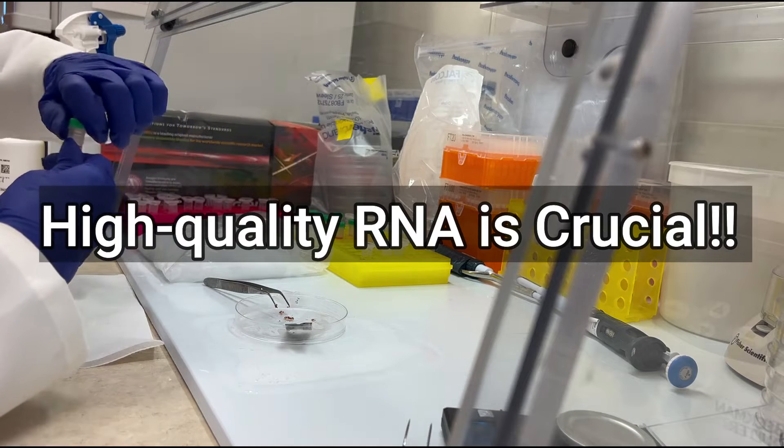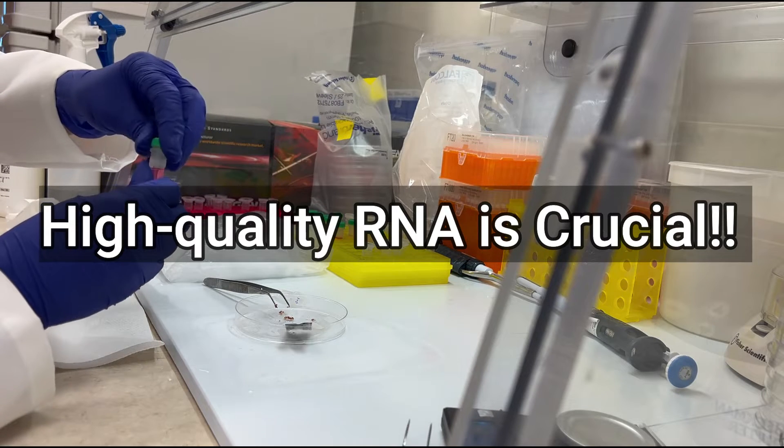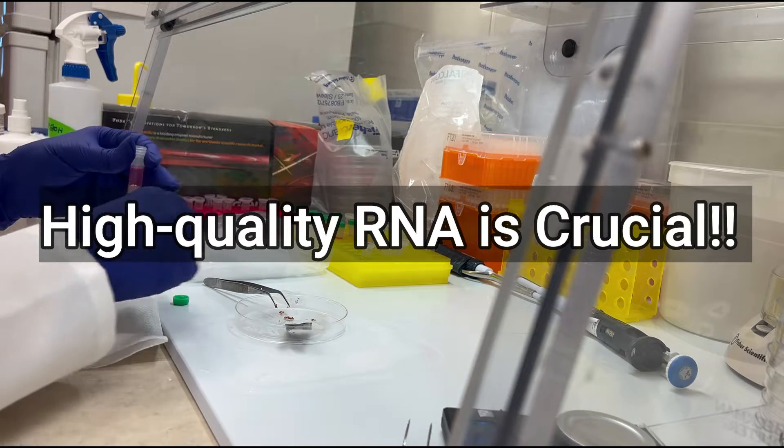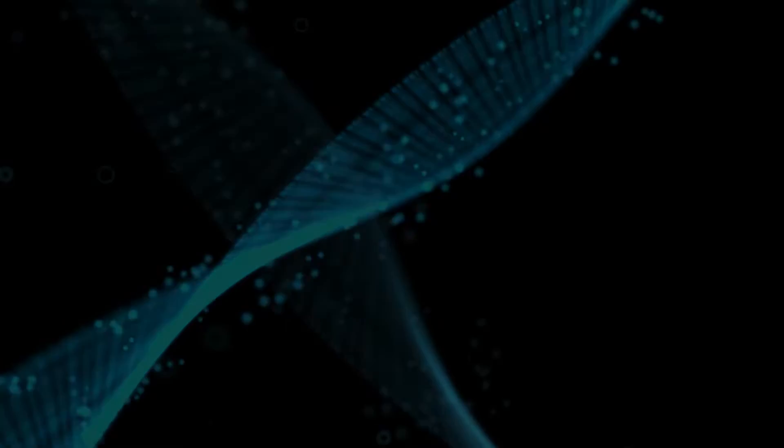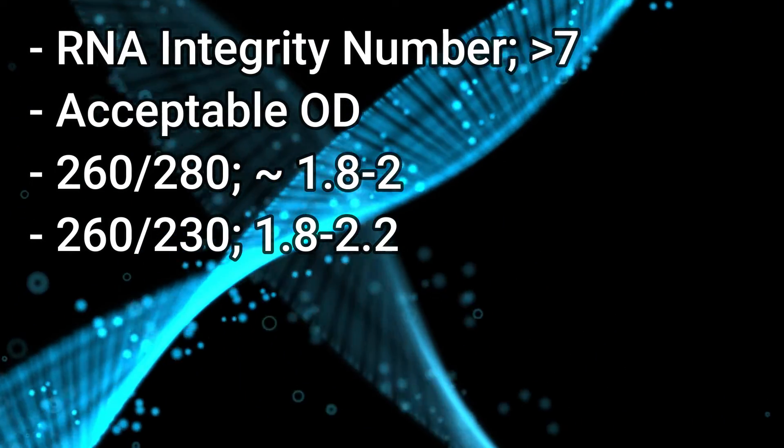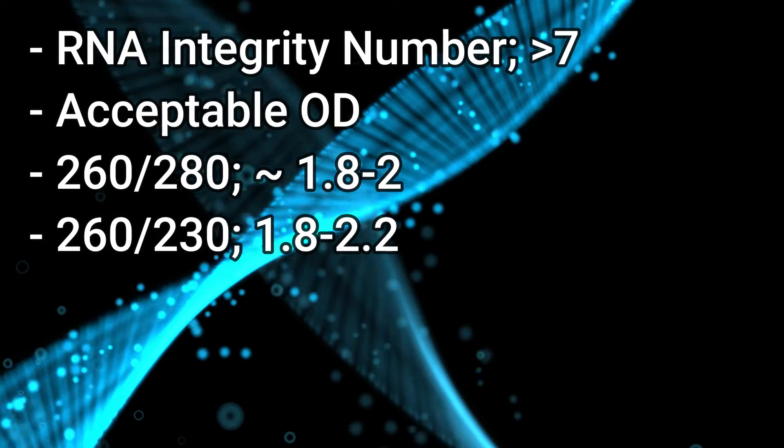Extracting high-quality RNA is crucial for various biological experiments like RNA sequencing. You must have an RNA integrity number above seven, along with good optical density and reasonable ratios to perform such experiments.